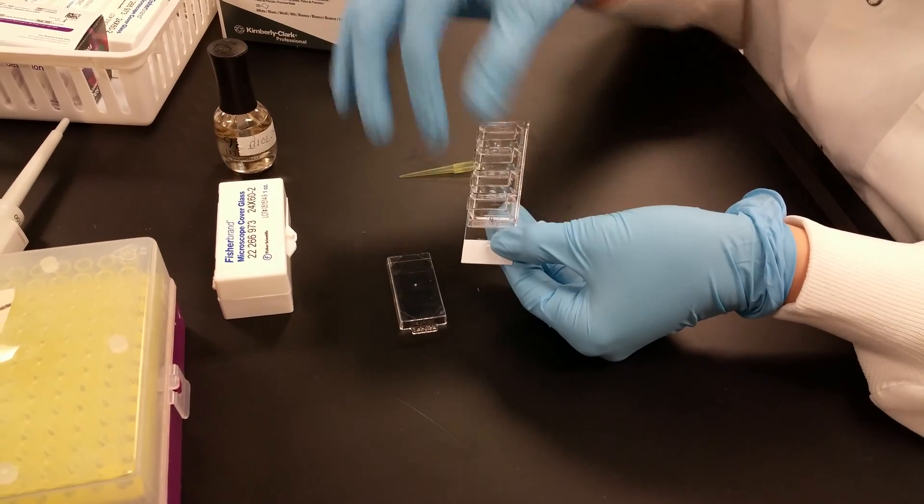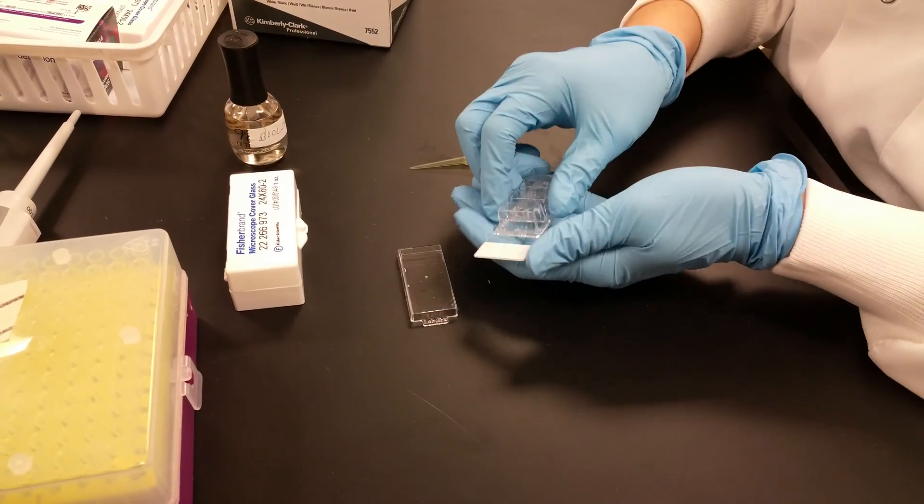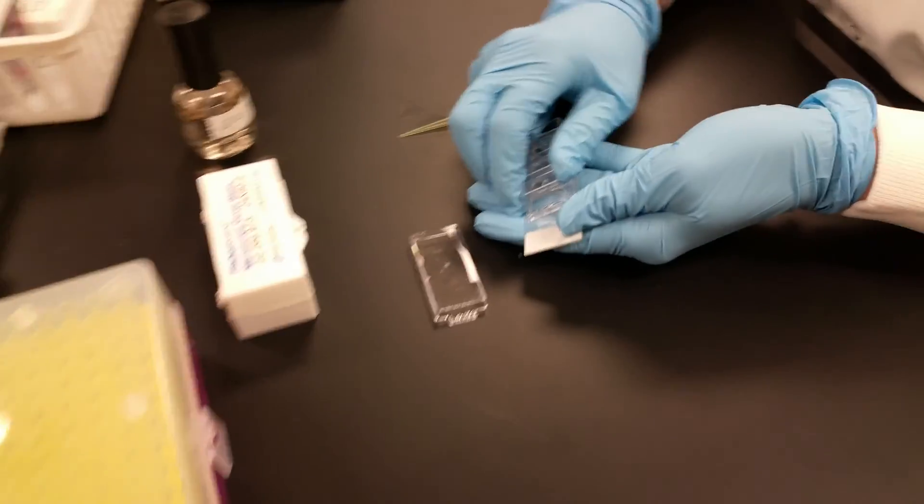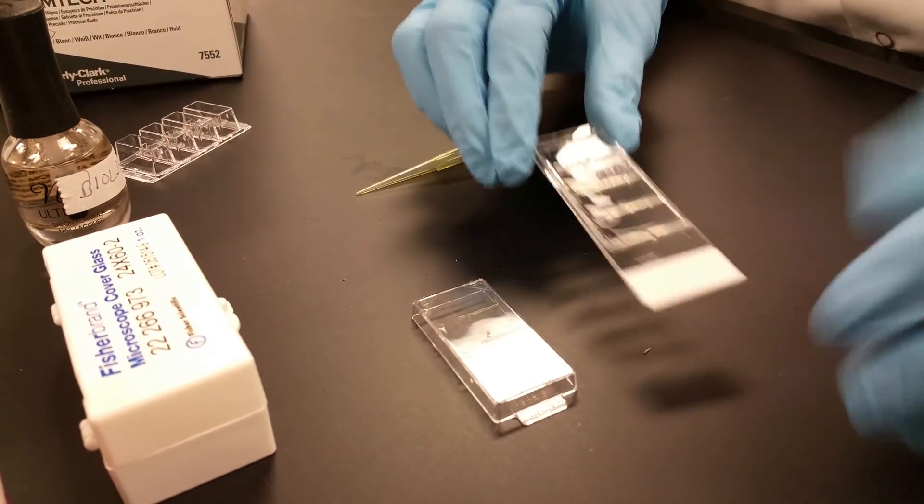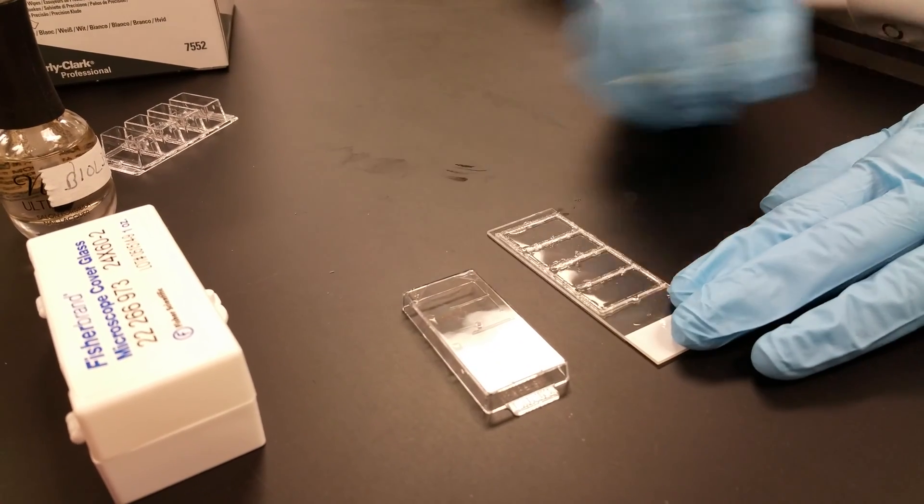Our first step is removing this plastic gasket. To do that, you just hold onto the slide and gently peel that off. You don't need this part anymore, so that goes away.